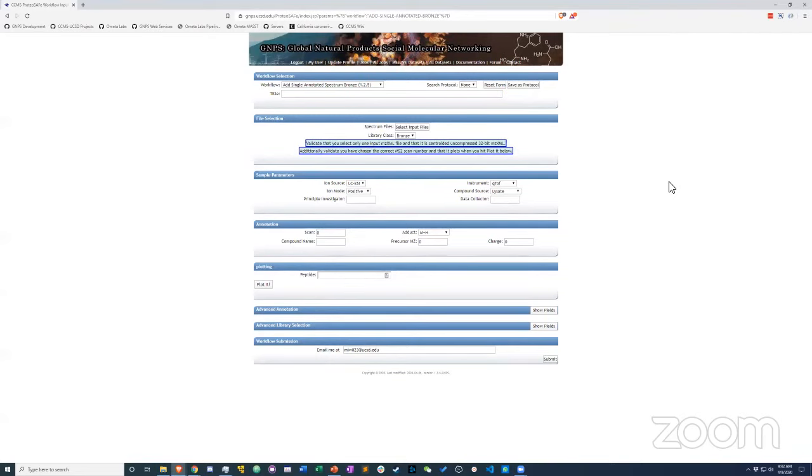So it's not purified. It's a mixture of multiple things, and this comes from the natural product space. Because there are multiple compounds in there, there might be the potential of different isomers, so it captures that it might be an isomer of the listed structure. It gives a little bit more ambiguity, relative to when you injected a single standard where you know the full structure of the compound.